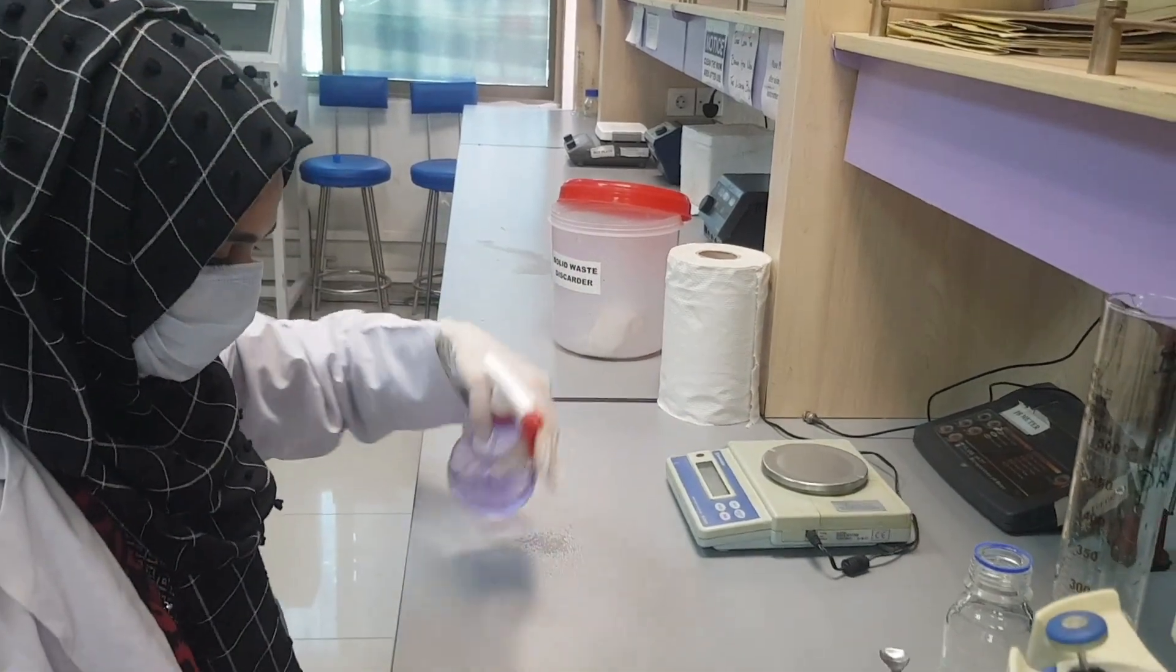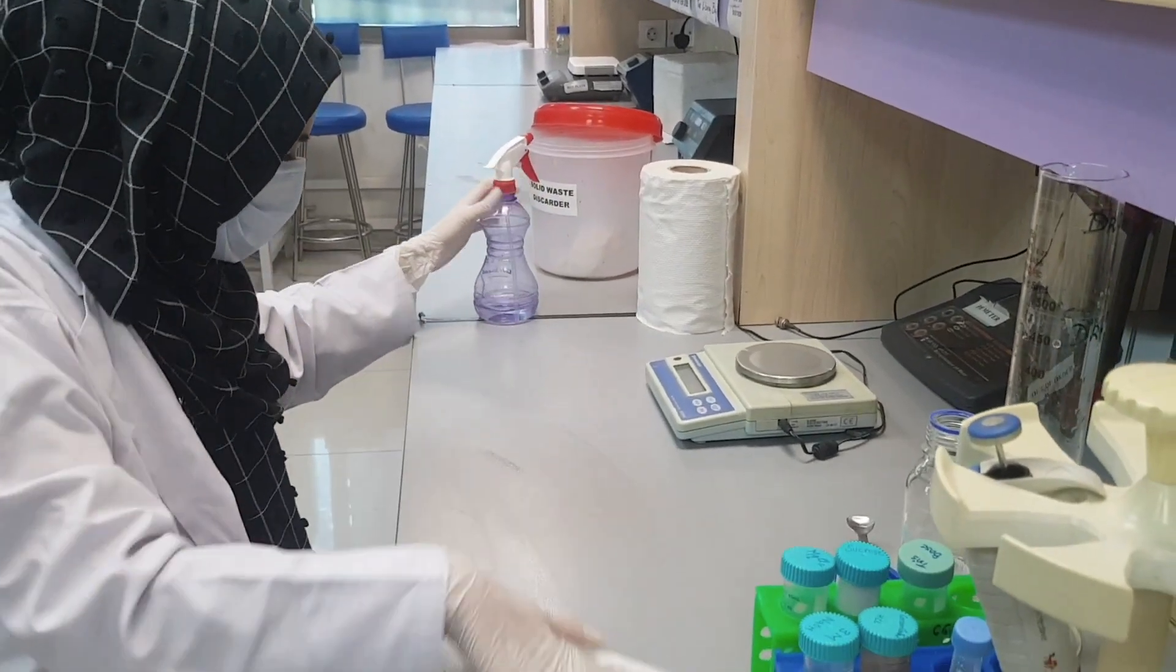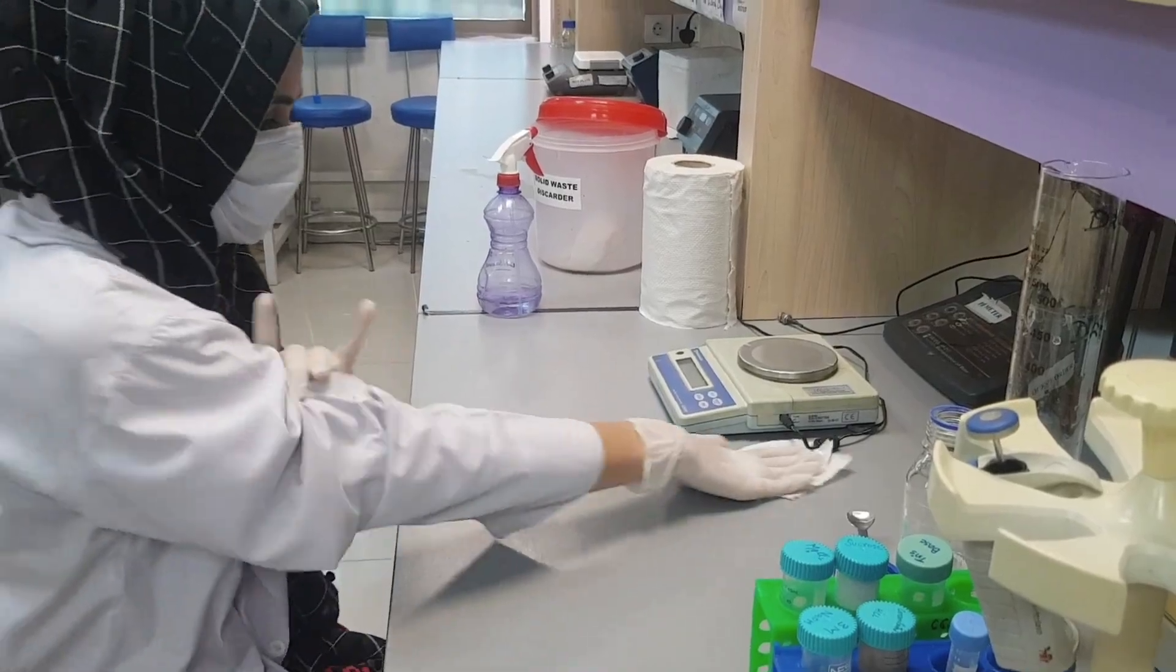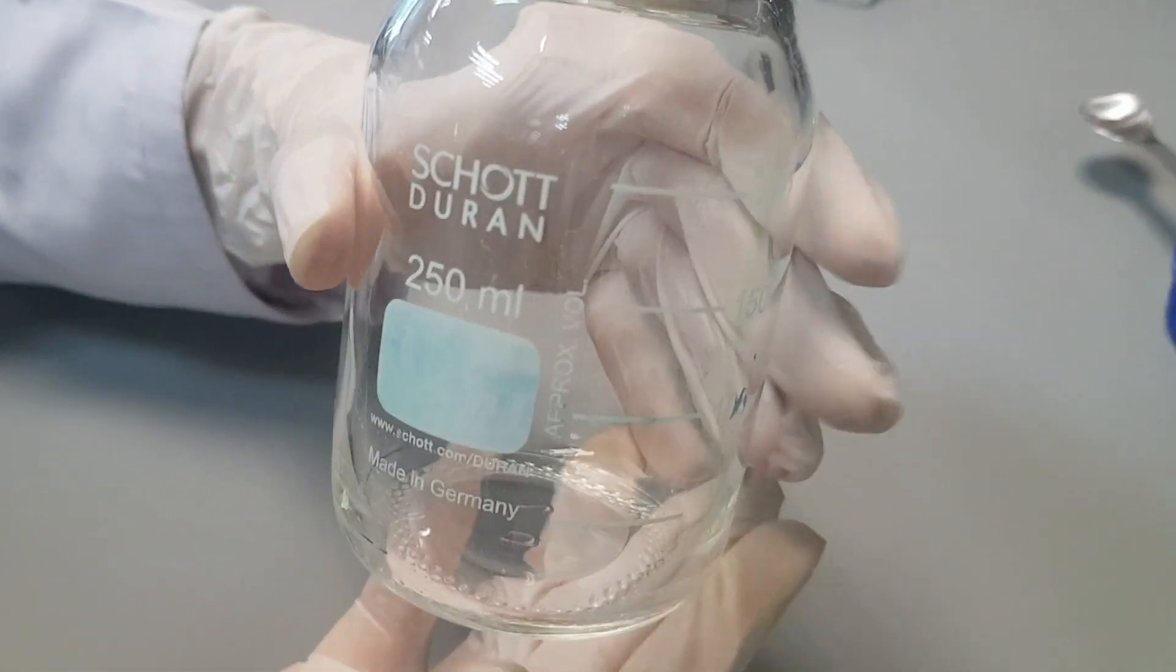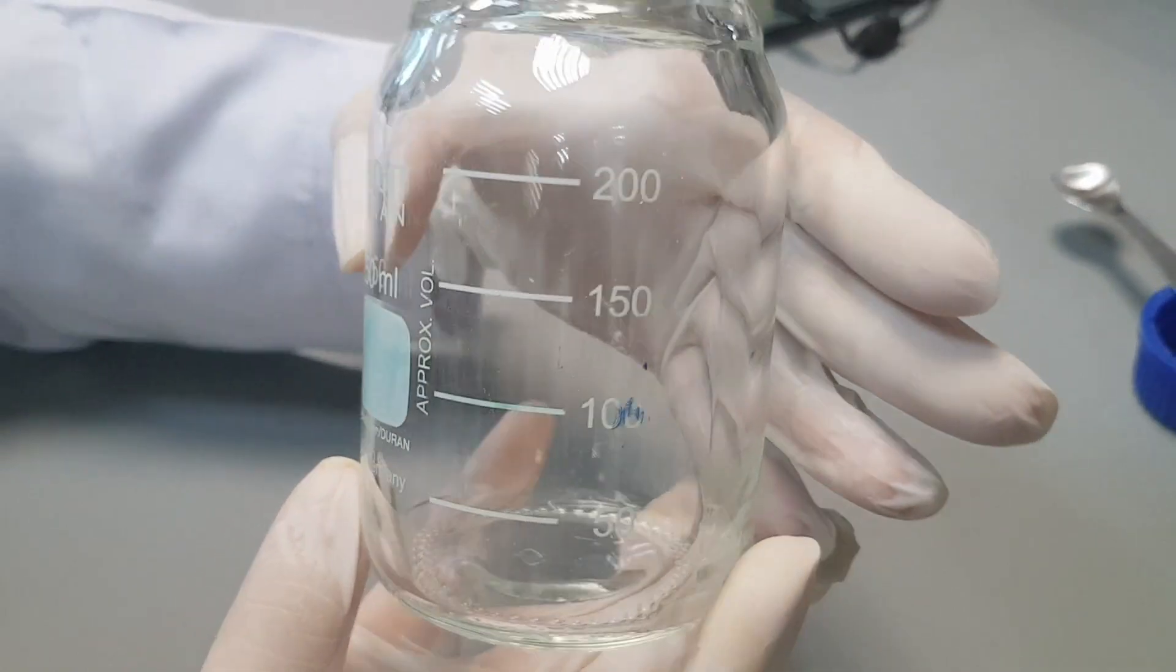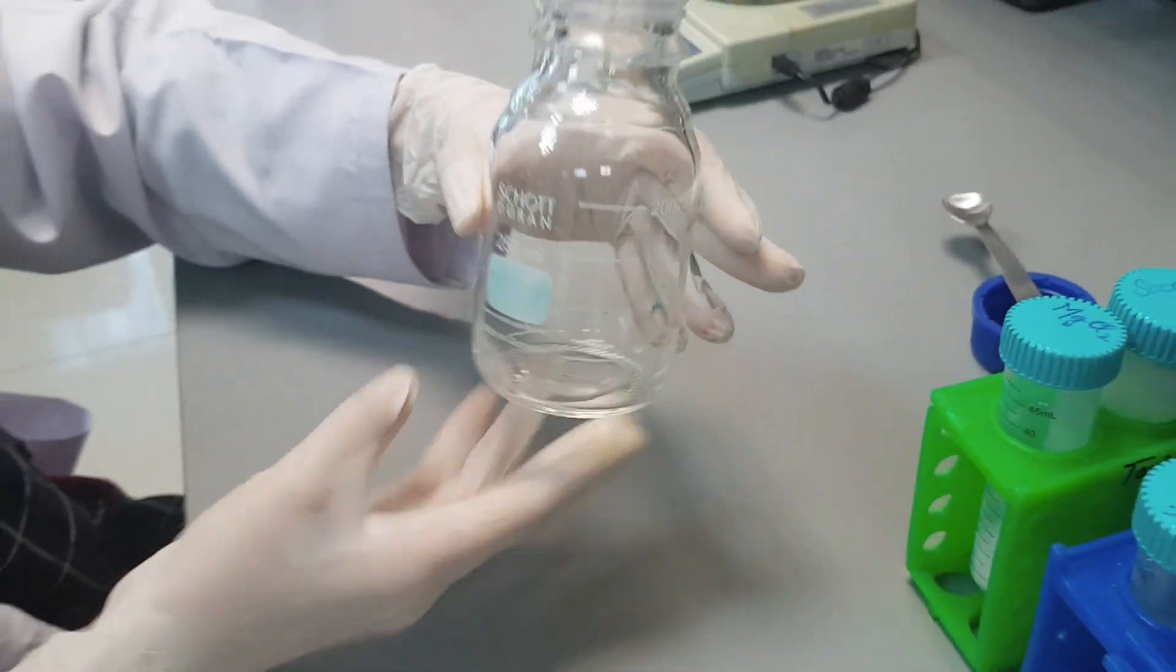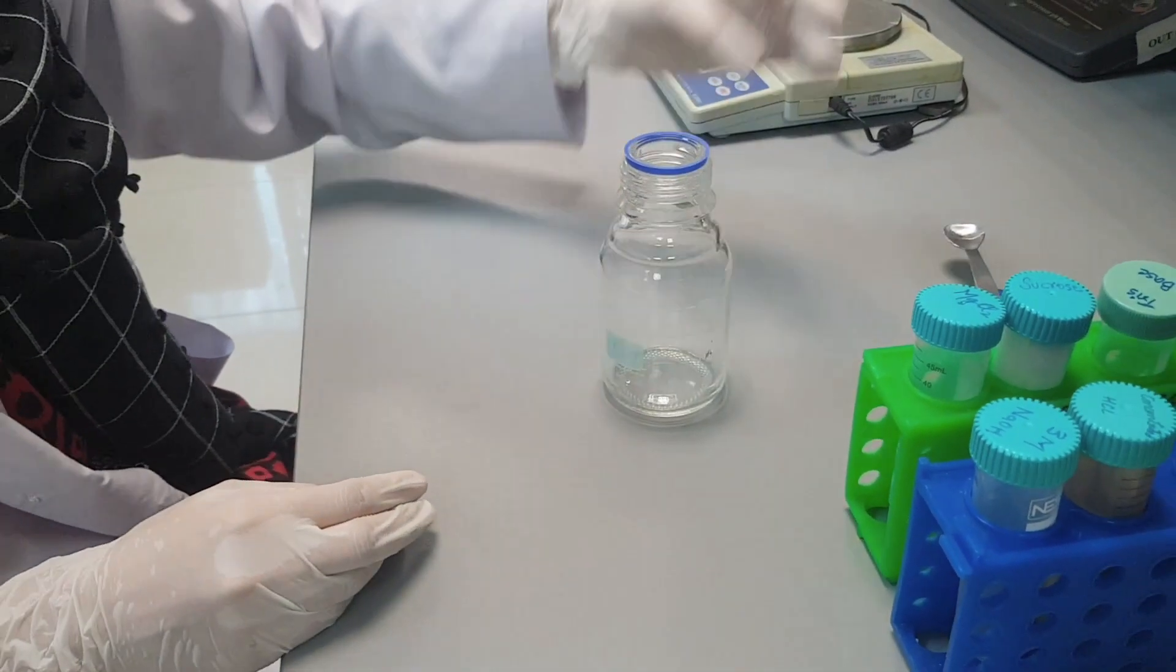First of all, clean the working bench with ethanol. Take a reagent water for preparing 250 ml of solution A. Put 100 ml of distilled water in a 250 ml reagent bottle.